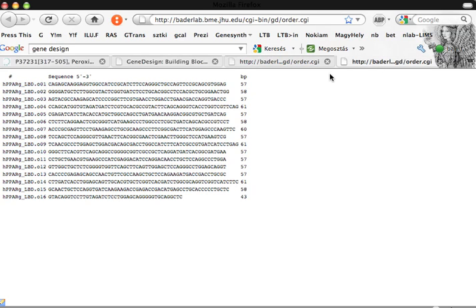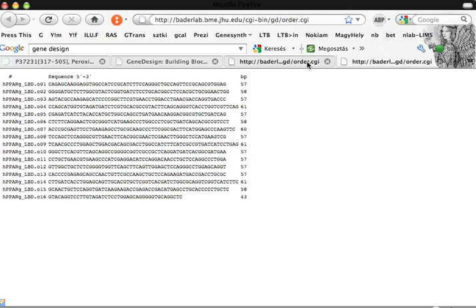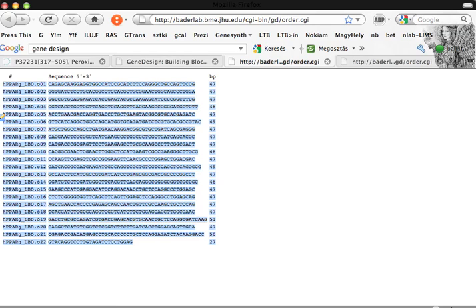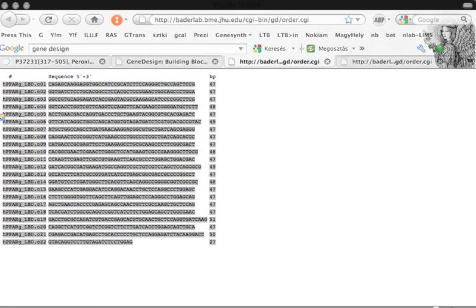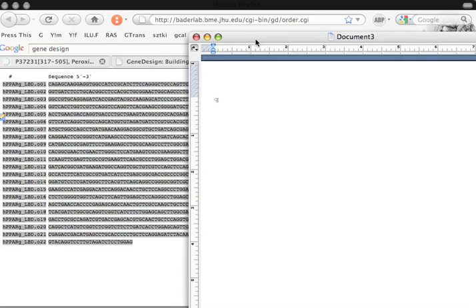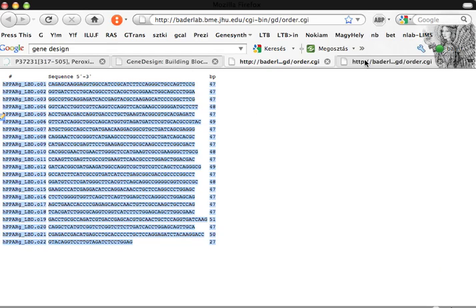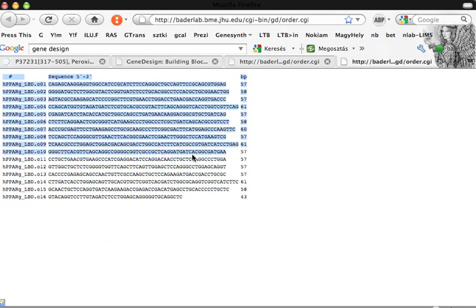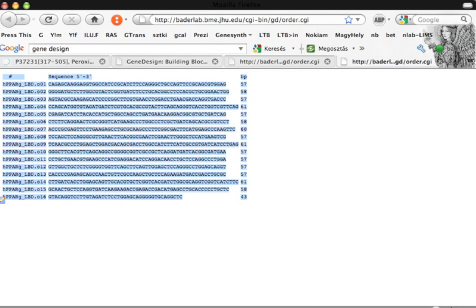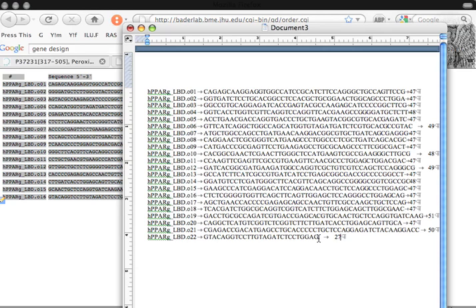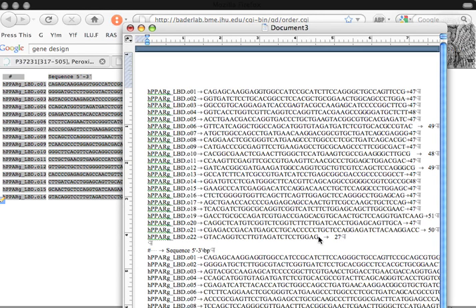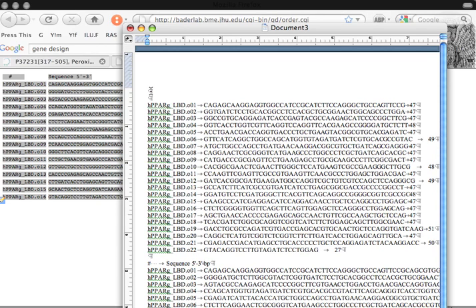We have here list of 22 oligos for PPAR Gamma which are shorter. Shorter oligos are cheaper and we have different lists a bit longer. Longer oligos are a bit more difficult to synthesize. This is the list we generated. These lists can be used for ordering the oligos and assembling the gene. It's worth saving these lists. Just simply copy and put them in a Word document. You can put both lists in the same document and save it with a clear name, like PPAR Gamma LBD oligos to gene synthesis. Save this file.